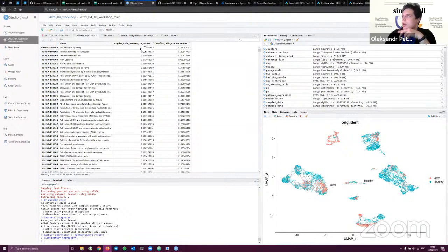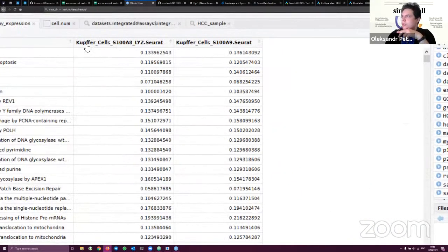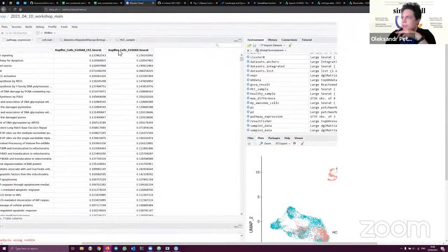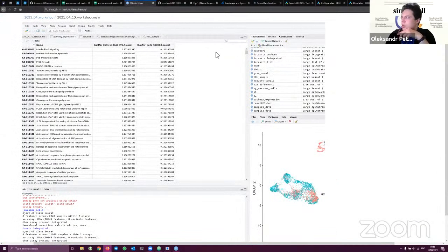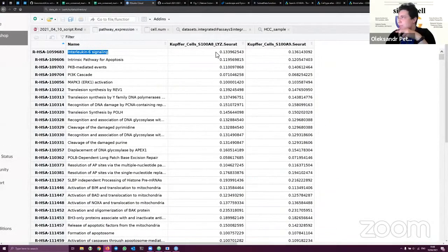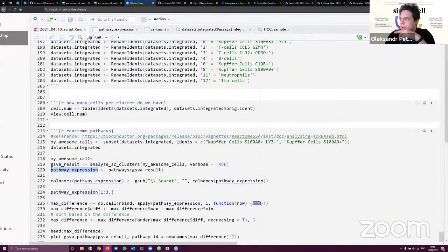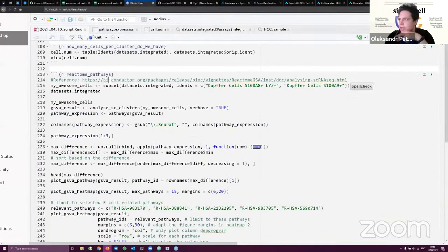So how does it look? We have two columns here: the score which was assigned to each pathway and the names of these pathways. Based on this score, we can sort these pathways according to the maximum and minimum enriched pathways, I would say. First of all, this I just took from the very basic manual, because you can obviously modify it and receive other outputs.